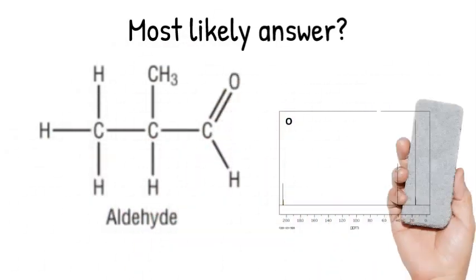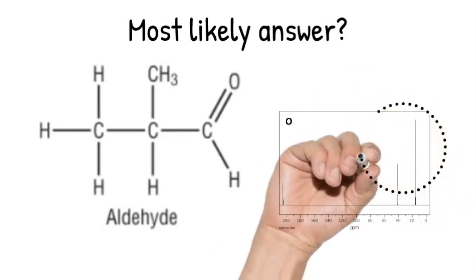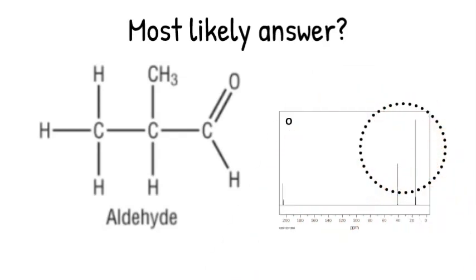3 unique carbons, and as you can see, the 2 peaks at the far right here are different in height, which possibly indicates that one of them has had 2 carbons contributing to it and the other one only 1. This matches with methylpropanal, as 2 carbons, the 2 CH3s, would show a higher peak, the peak on the far right, and the carbon with the hydrogen is responsible for that very much smaller peak.